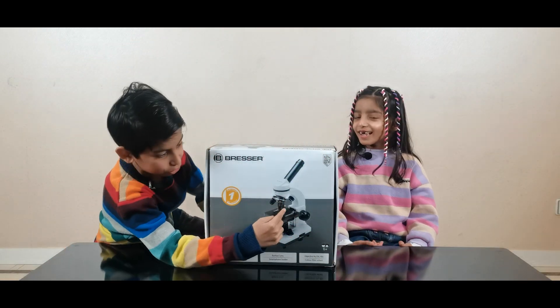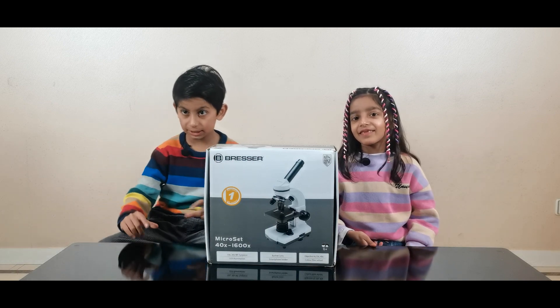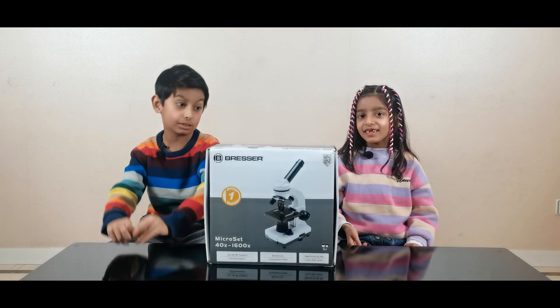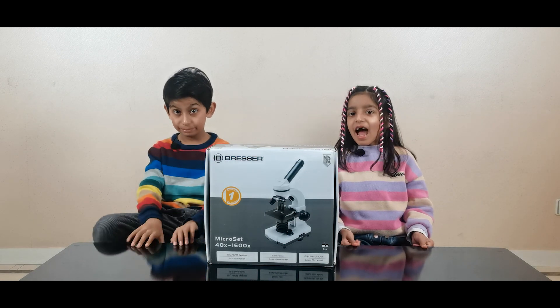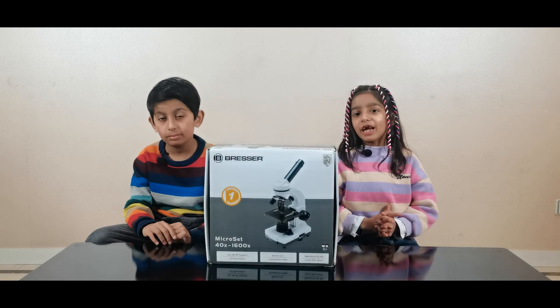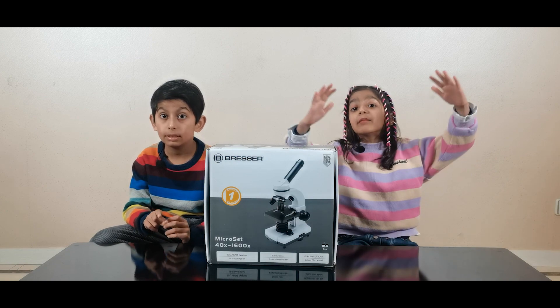Guys, do you know what a microscope is? A microscope is something with which we can see something really tiny — much bigger in a microscope. Guys, do you know how much bigger it could be? Up to 1600 times bigger!